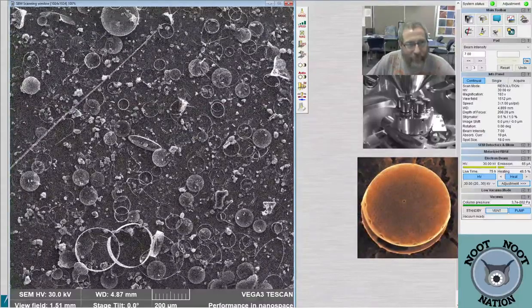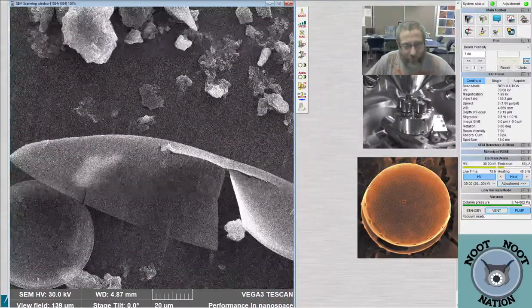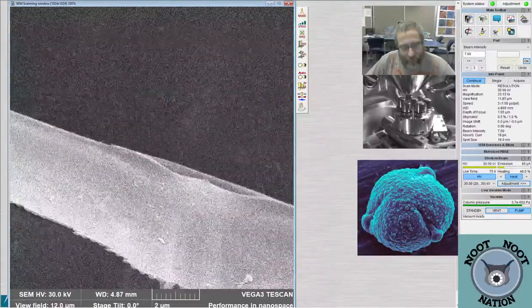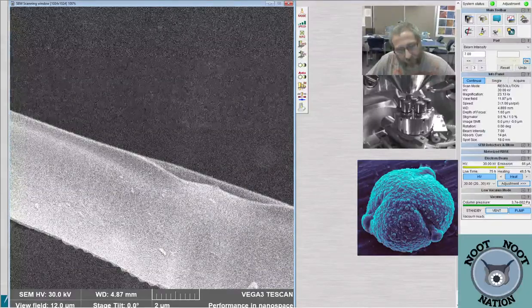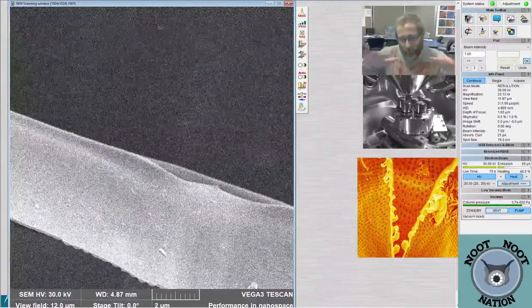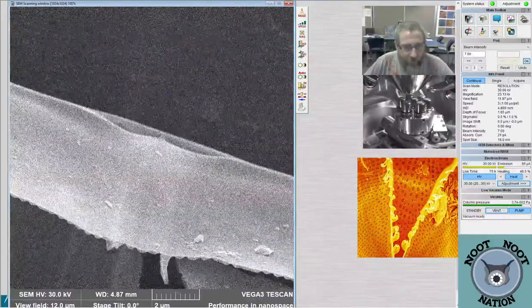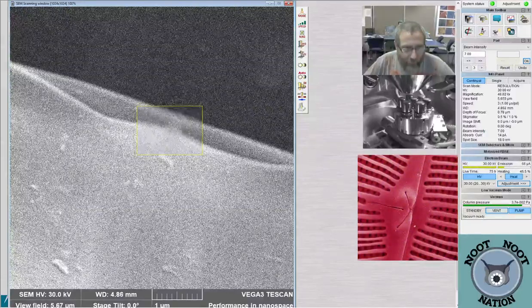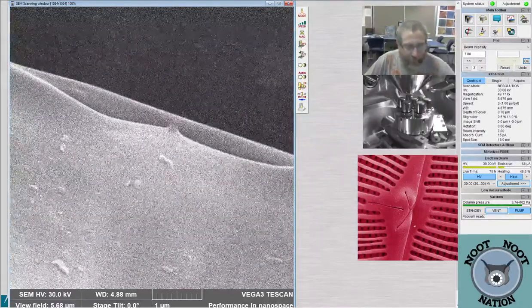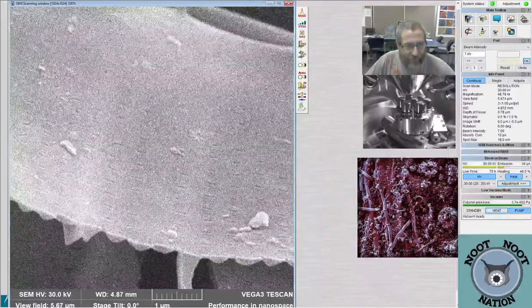And then I thought maybe if I went up to this one, we could look at it. It's been torn. Yeah, it broke, but this should be the raphe here, and it is. That's just on the edge, right? They're shaped sort of like the raphe is at the top, and then the rest of the diatom is curled away from the raphe. So this is a pretty unique shape for a diatom. Let me get it into focus for you. But that is definitely the raphe. To me, there's no question. The only thing I don't know is if this is the same thing we were just looking at, because these holes on the valve face are slot shaped.